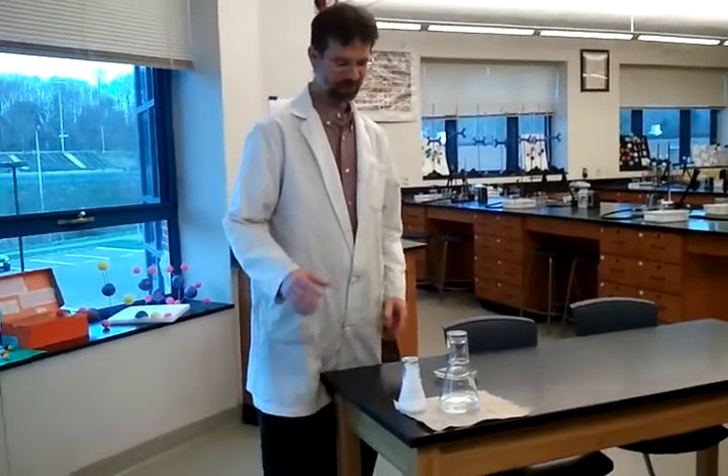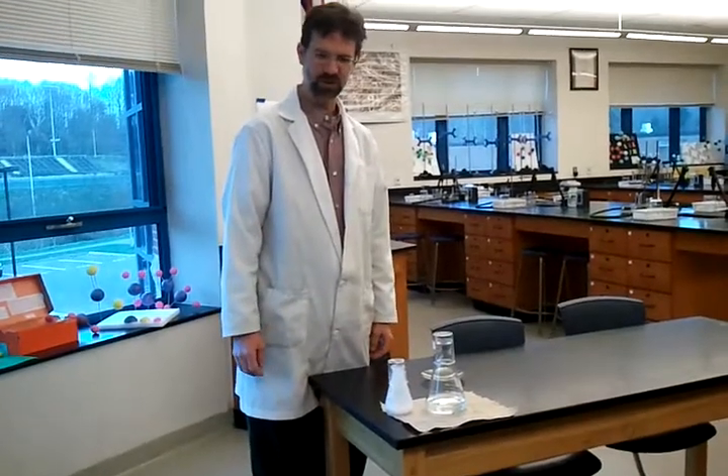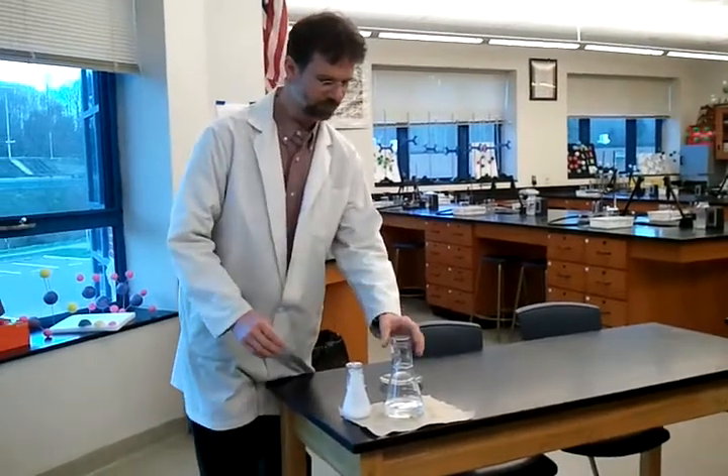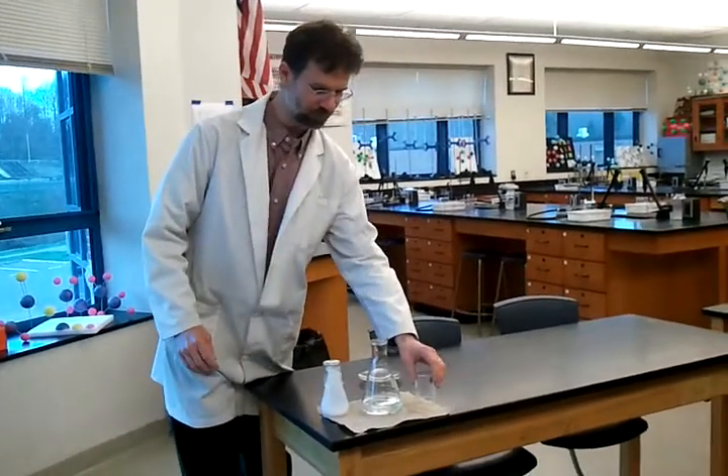Then you add even more solute, heat it up, and dissolve the remaining solute, and then slowly cool it, and you wind up with a super-saturated solution.